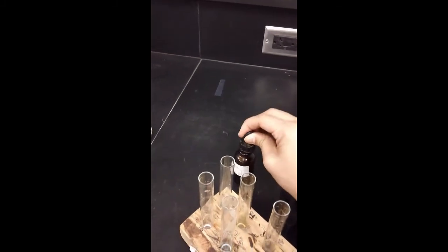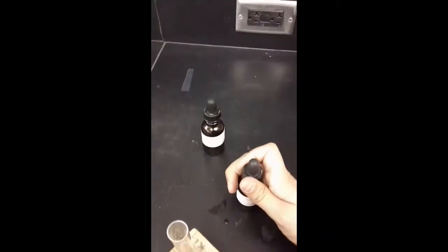According to the directions, I will have gone over here. I will add 1 or 2 drops of HCl, hydrochloric acid, to each of my test tubes. 1, 2. Looks like that bottle cap has a little broken, so I'm going to grab a different one. Never want to work with broken chemical bottles.